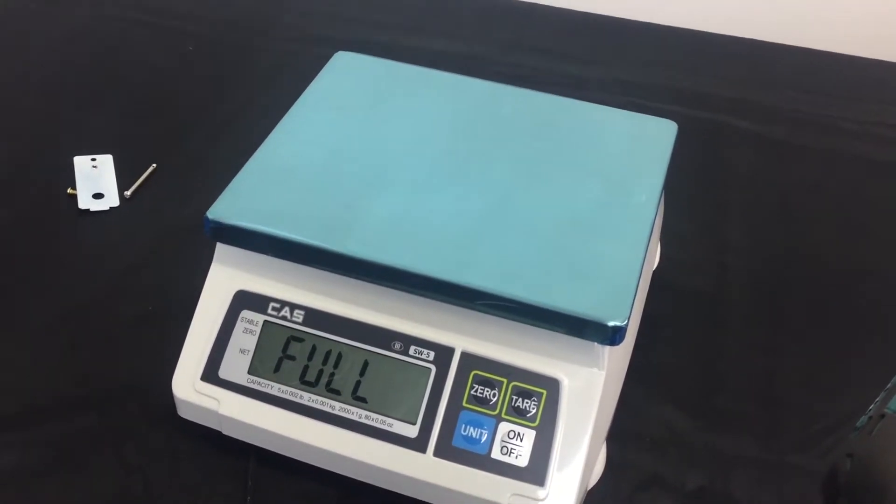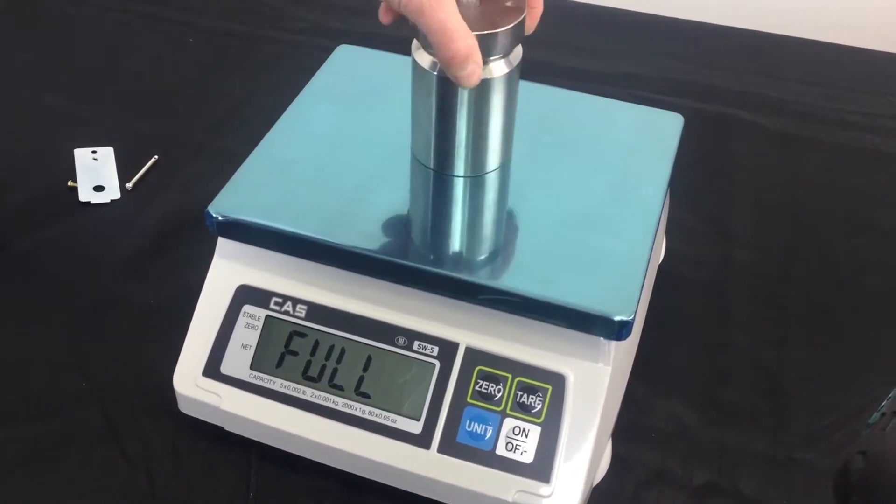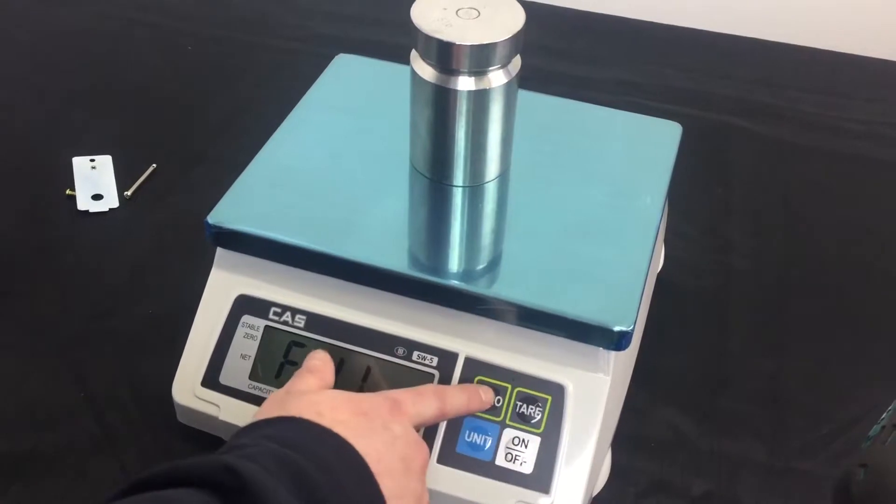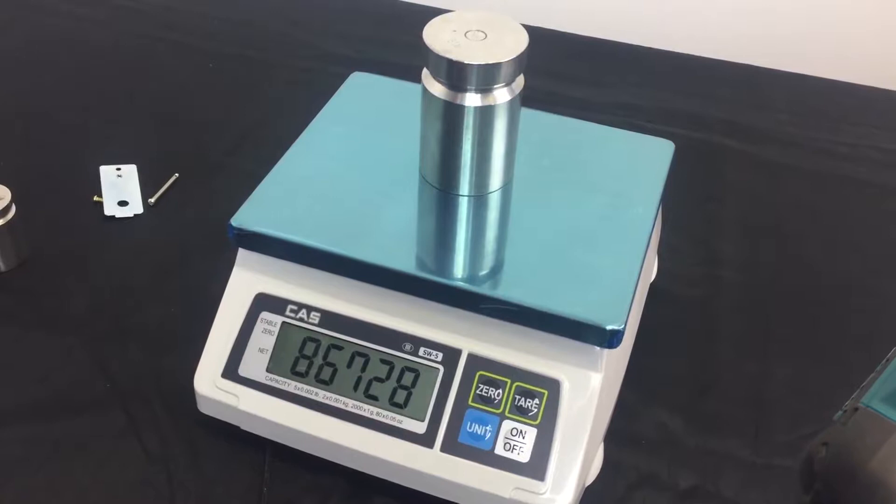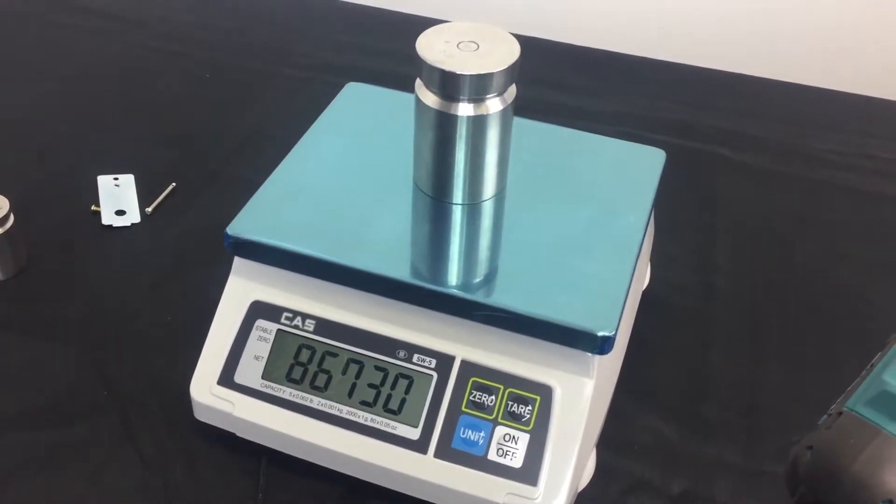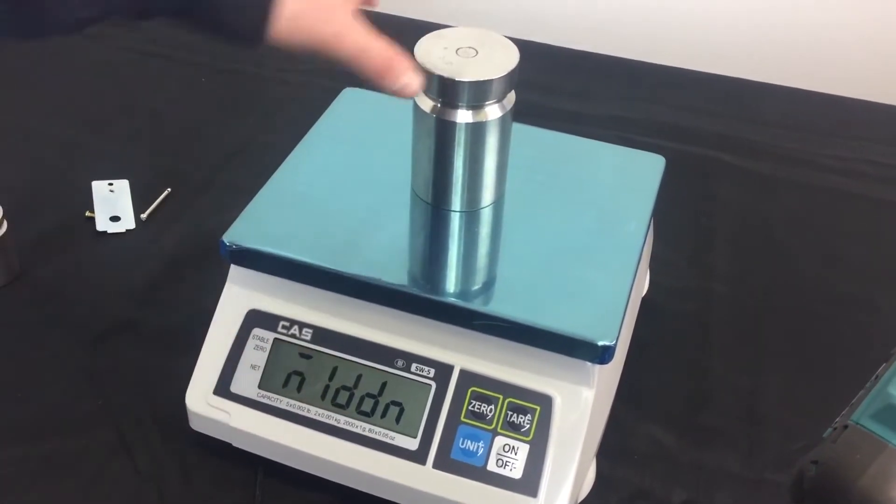Now, we remove the two pounds. We place our full capacity on, which is five pounds for this particular model, and then we press the zero key. You want to see your raw counts bounce around a bit, which is normal, as I said. Wait till it stabilizes, and it'll say ND down.